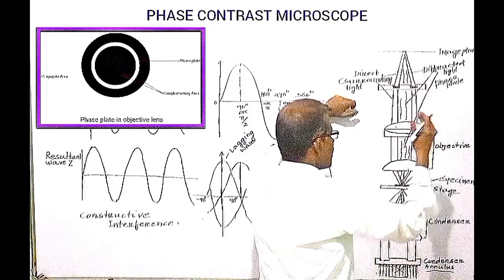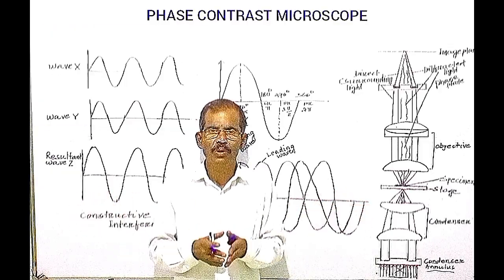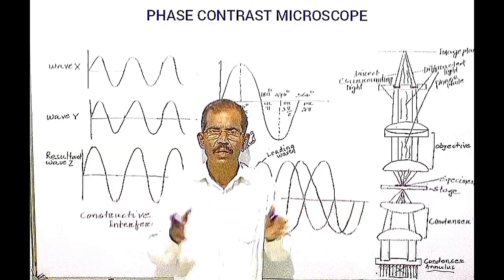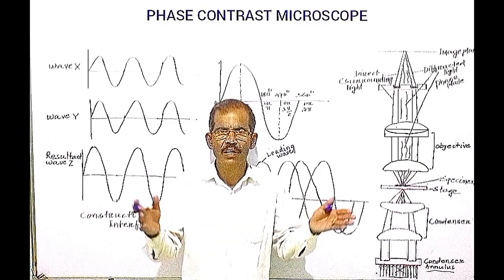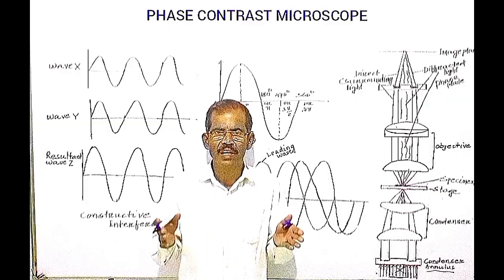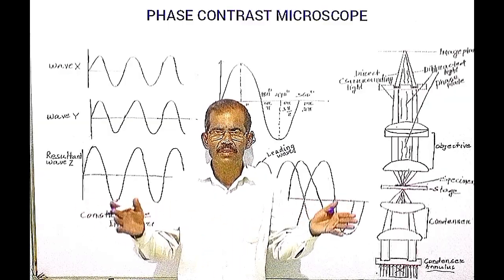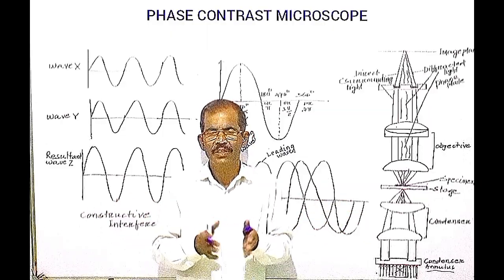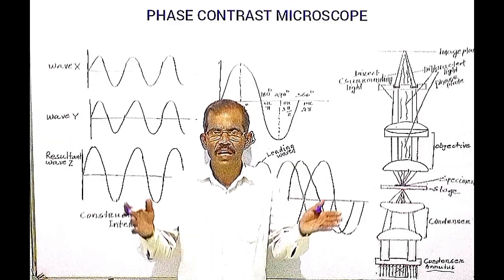the complementary area. The phase of a sinusoid wave is the angular displacement that specifies its position relative to a reference wave. A wave can be retarded or can be advanced. When this happens, we say that there is a phase shift. When the wave is advanced, then the phase shift is positive. But when it is retarded, we say that the phase shift is negative.